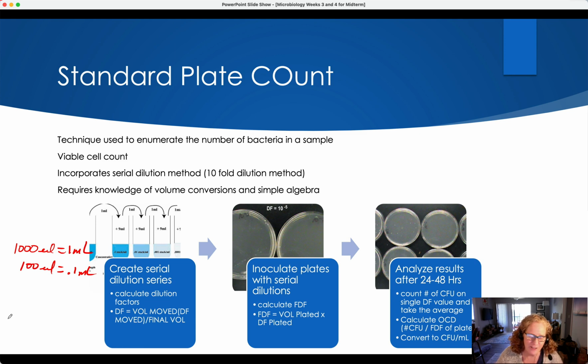We also want to make sure that we know scientific notation. So in scientific notation, we have, of course, 100 is equal to 10 to the 2. 1,000 is equal to 10 to the 3, right? 2 zeros, 2. 3 zeros, 3. But this also works in reverse.